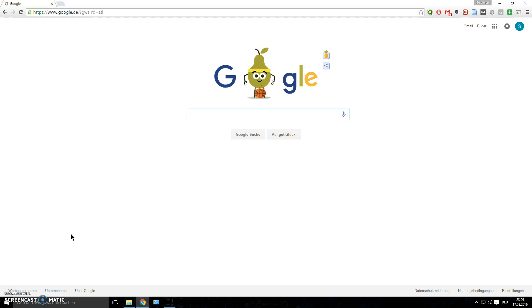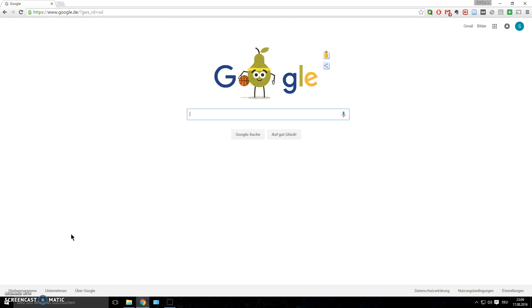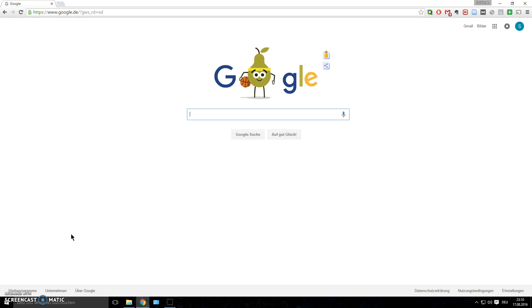First things first: the operating system you work on is very important. You can work on pretty much any OS, but in my opinion a Unix distribution works best. I recommend installing a Linux distribution such as Ubuntu. If you're not into programming or bioinformatics, you're most likely used to Mac or Windows. Mac is fine too since it's also Unix-based, but I still recommend installing Ubuntu.